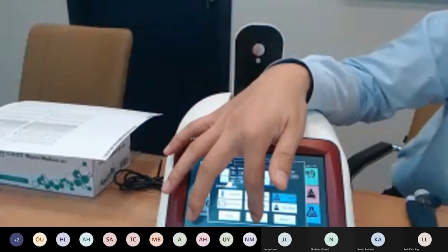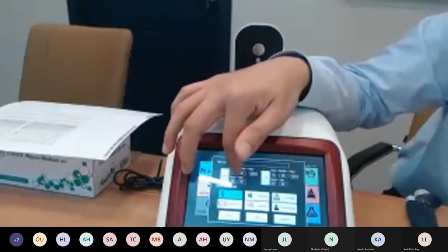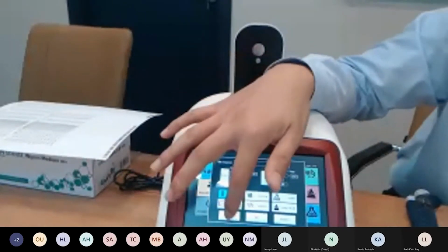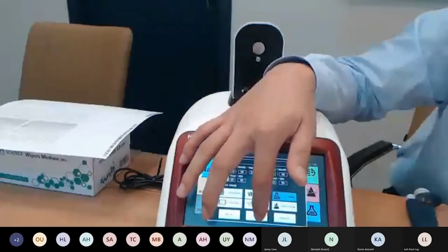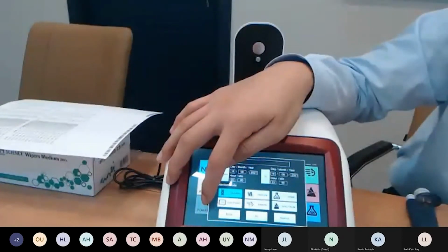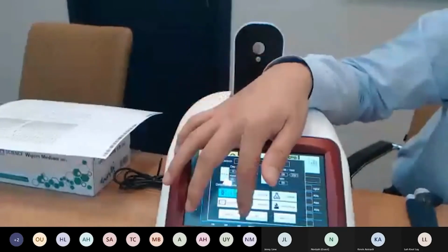But if you just click all, once the data is there, you can search for it from this page as well.